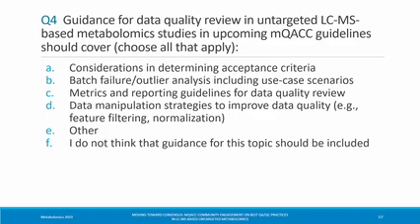So we ended up spending a lot more time processing our pool QC and our reference materials, in terms of running standards alongside there, and then dropped that horse plasma sample. So I think you can get a feeling for whether a matrix or a sample set, a reference material is going to be useful for you long term going forward.